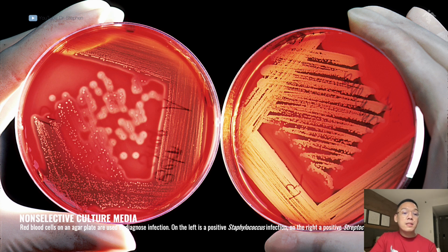These are red blood cells on an agar plate that are used to diagnose infection, the blood agar. On the left is a positive Staphylococcus infection, and on the right is a positive Streptococcus infection, showing you the differences in how the microbes utilize the blood in the agar, because they are able to perform hemolysis.